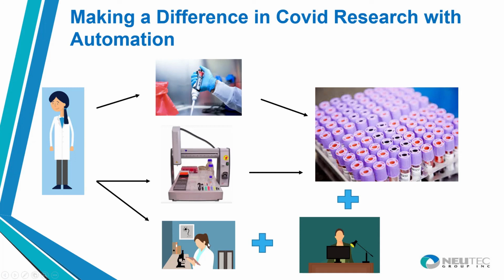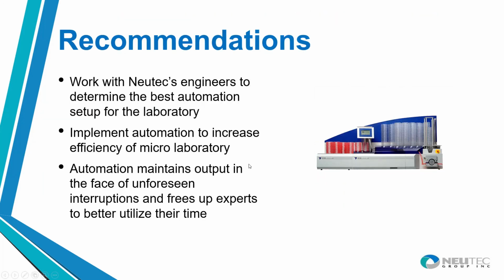Again, that may be just automating the media kitchen, or it may be just automating inoculation, or maybe just automating colony counting, where you can now increase your output in colony counting by 20 more a minute by being able to have this automation option and have the system that can actually just go down and quickly count the colonies, and you're not relying on somebody having to look at those plates all day long trying to count those colonies.